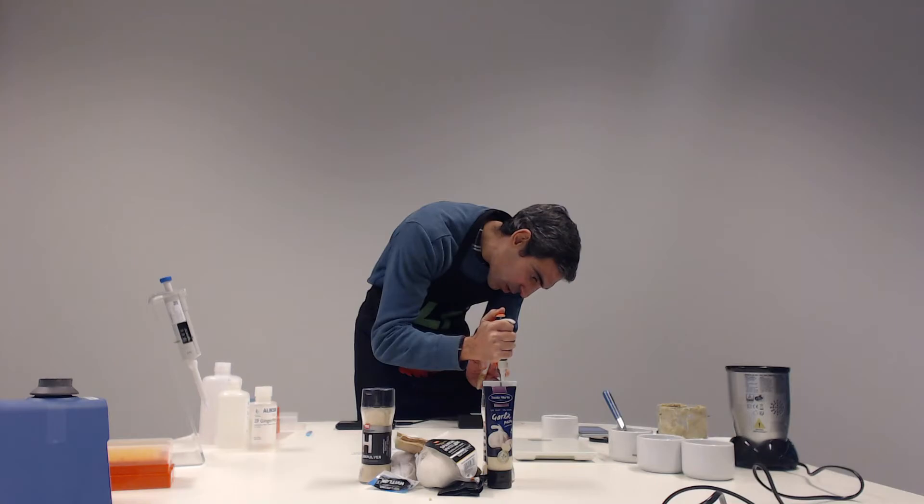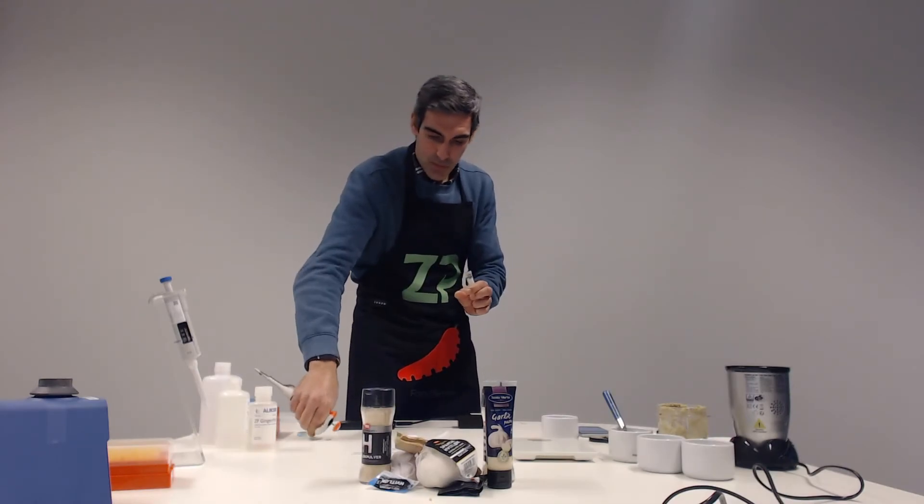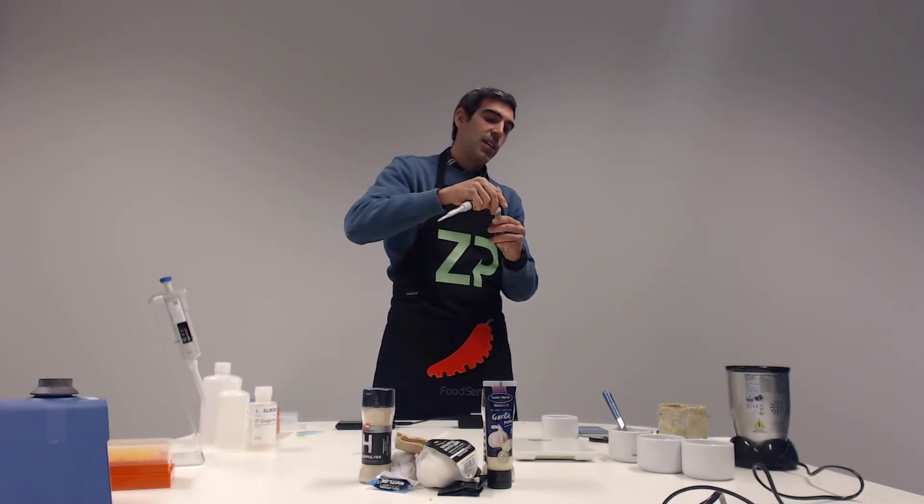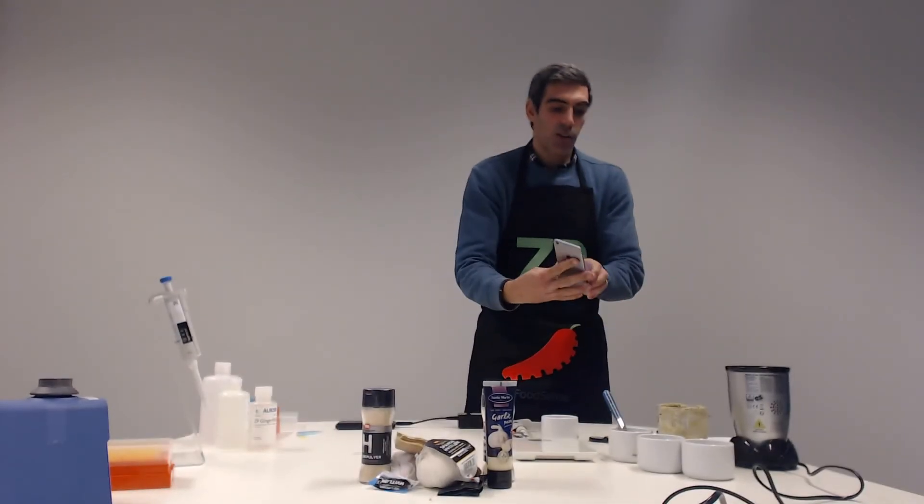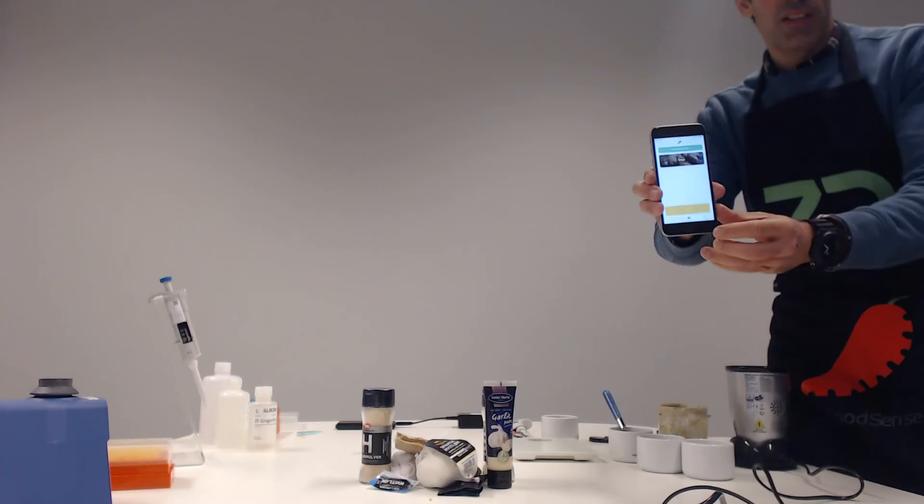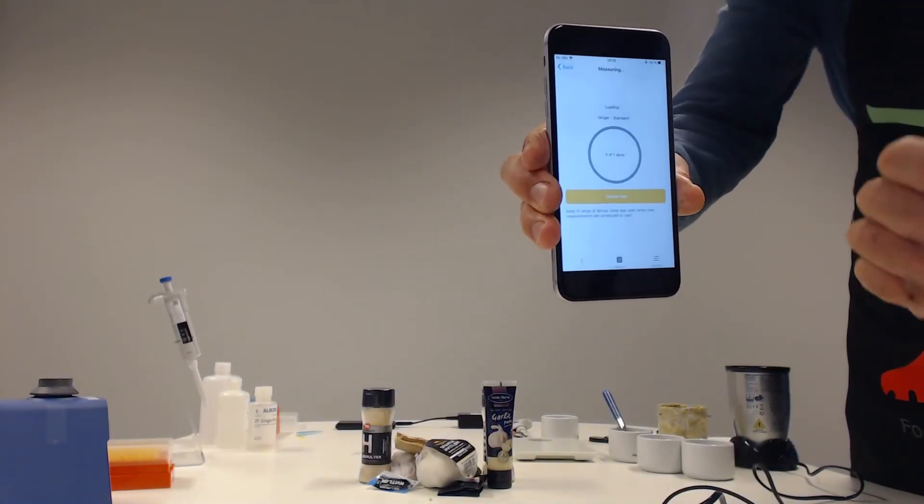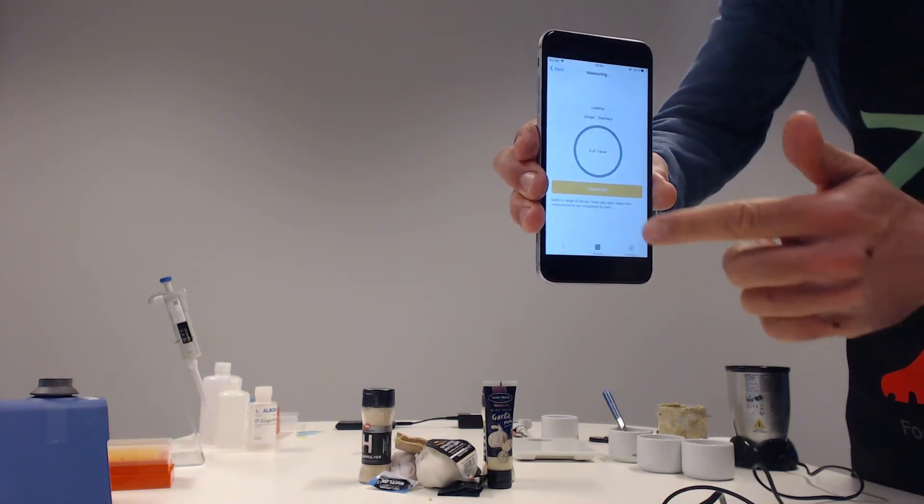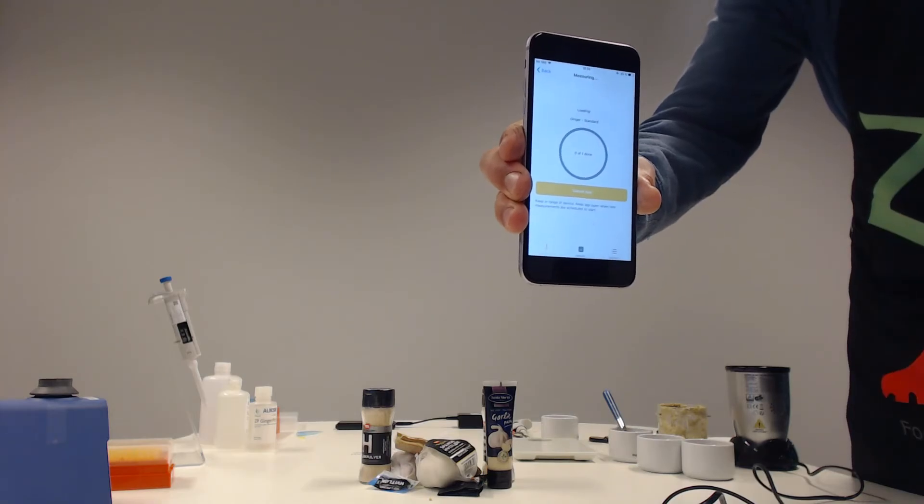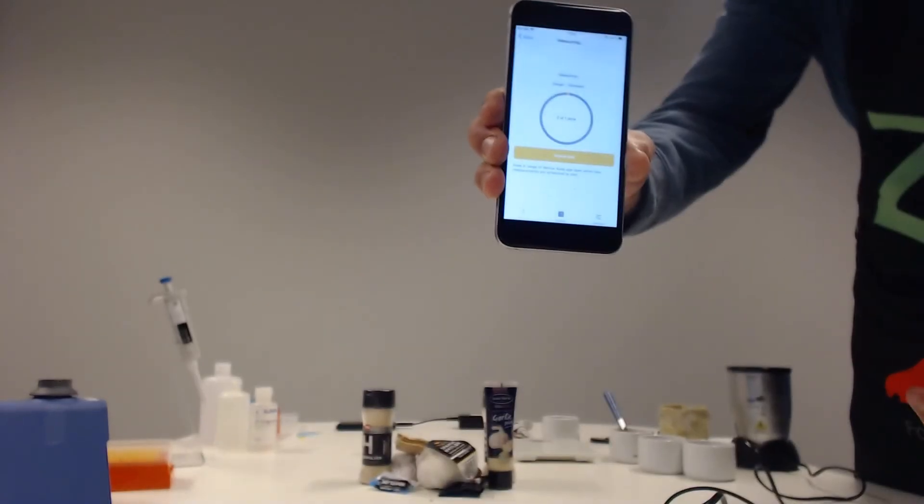And now I will pipette, just covering the electrodes in order to build an electrochemical cell. So I have to cover all three electrodes: working, counter, and reference. And once this is done, on the app, you then press measure. Now we have to wait for the assay to be completed, which means we have to wait for this yellow circle to be fully yellow.